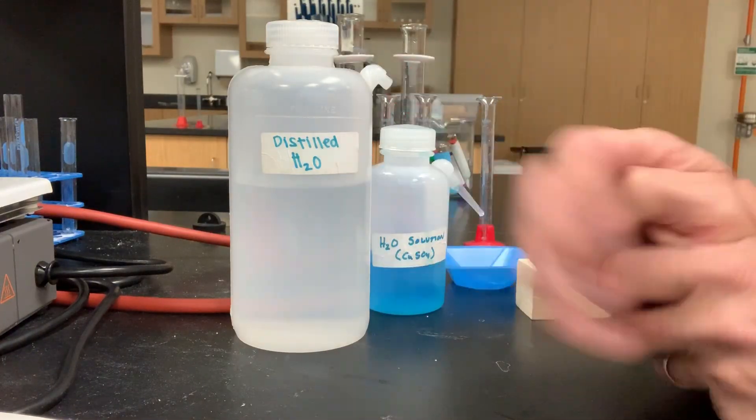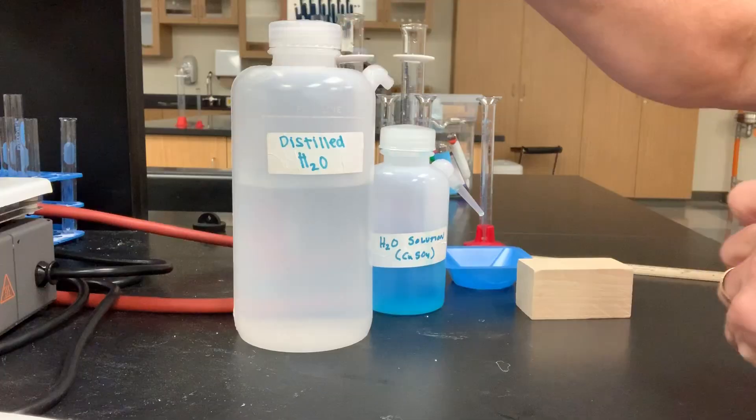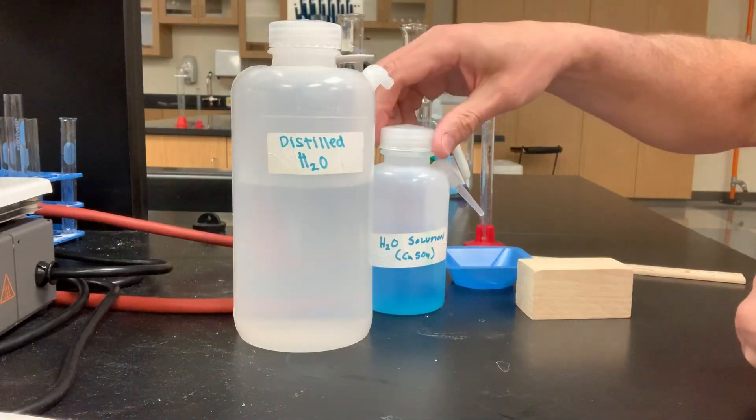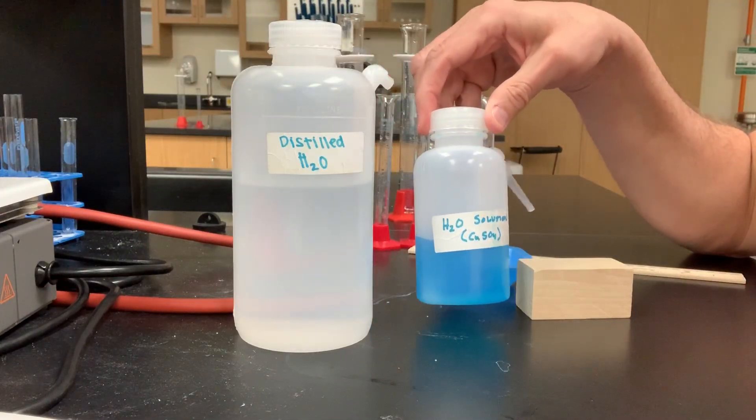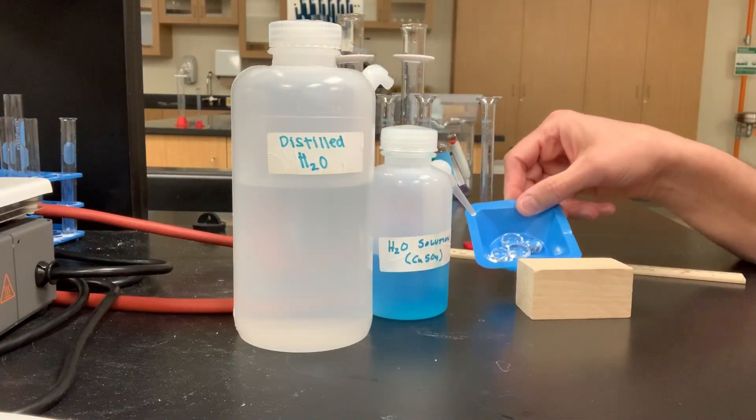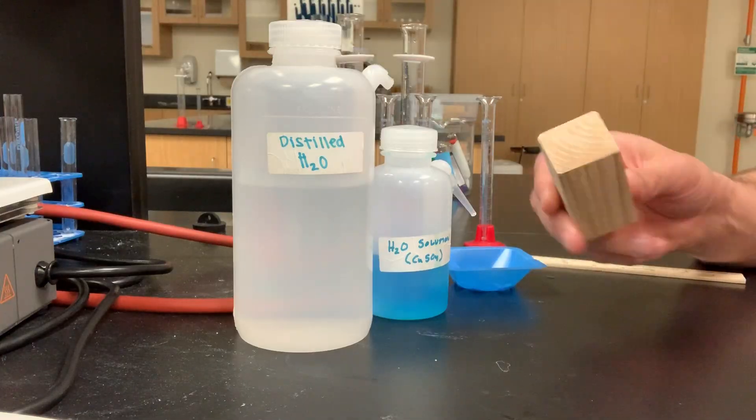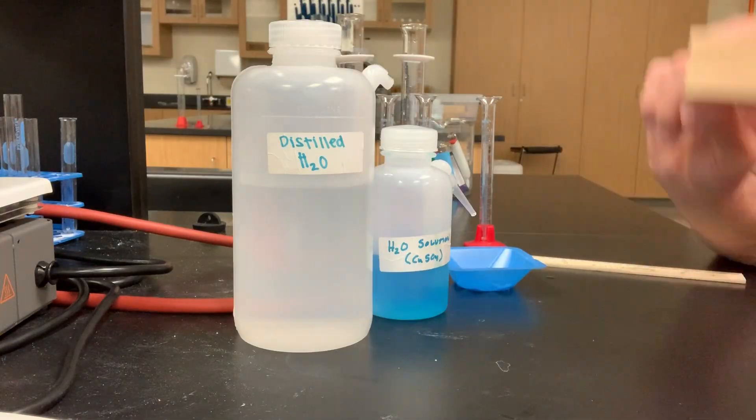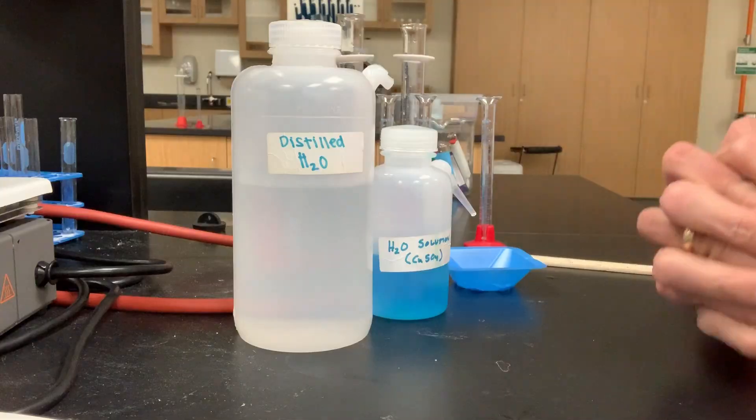We're going to find the density of four different things: a sample of distilled water, a sample of some blue salt water, some glass beads. We'll find the density of those glass beads today, I hope, and a nice pretty block of wood. So let's just get right to it.